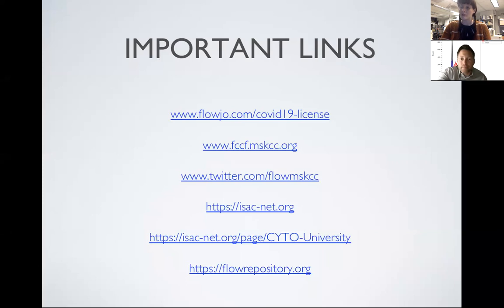Flow Repository is a nice resource for anyone who might not have FCS files of high parameter data at their disposal and wants to play around with some of these dimensionality reduction tools and clustering algorithms. There are definitely a couple of data sets on Flow Repository that would be beneficial for you to use, including a recent 40-color data set, I believe, that should be going on there.